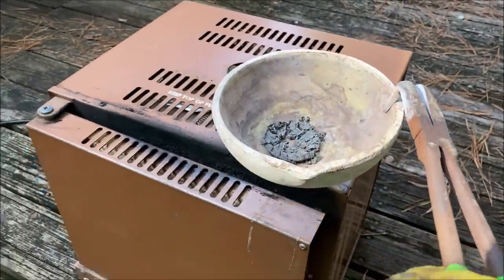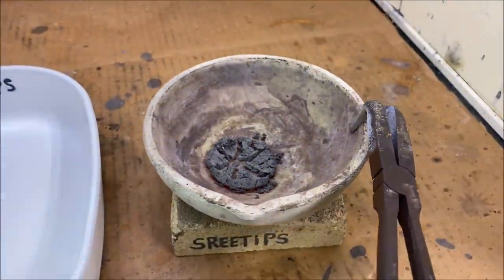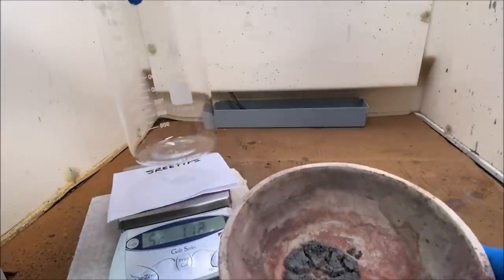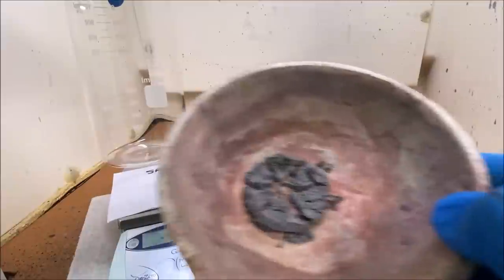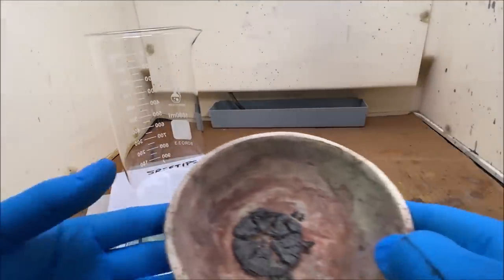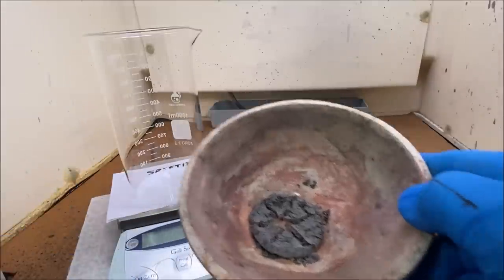Take this in, let it cool off. Here's our material, and it is looking right pitiful. The name of the game here is concentrating the values, and we've done that, and this is all that we have left right here. I'm gonna add this to the beaker.